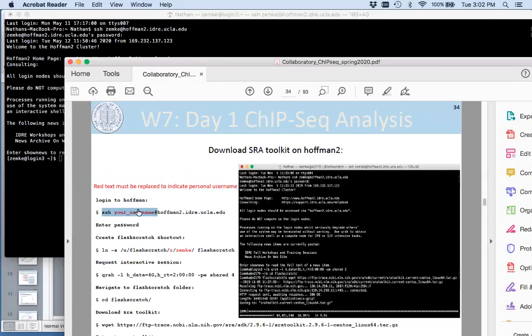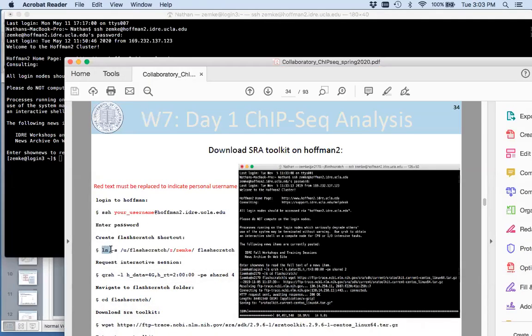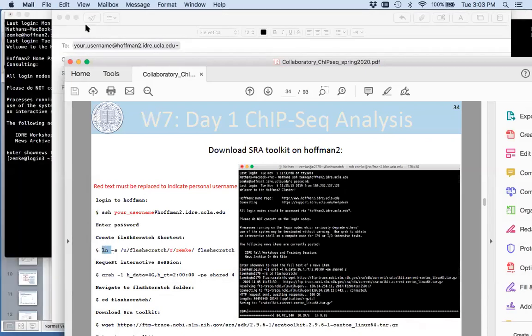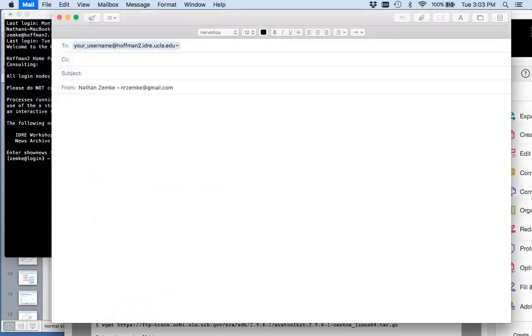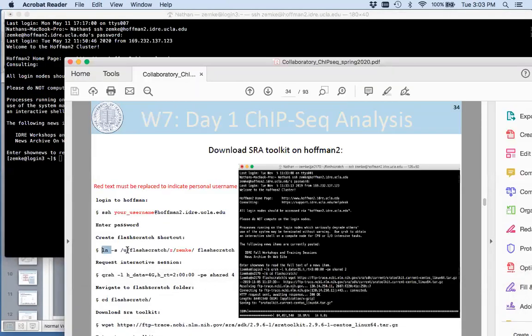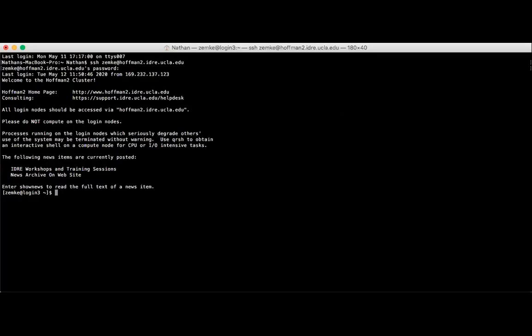So if you're gonna copy and paste the command, don't include the $, or the space before the command, and try not to include anything after the command either, because that might confuse it. So do it like this. All right. I'll probably type out most of them.